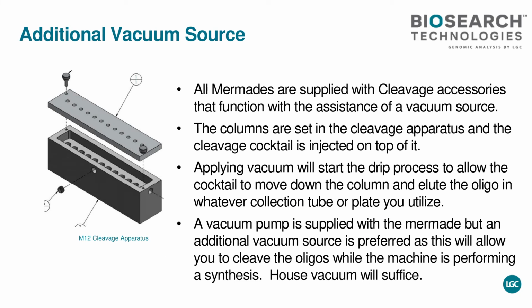When you do the cleavage, you can use this kind of instrument. You just put your column on the top, you put the ammonium hydroxide, you leave enough time, you collect the oligo at the bottom, and afterwards you will make the treatment according to the temperature and the time you will have to use.